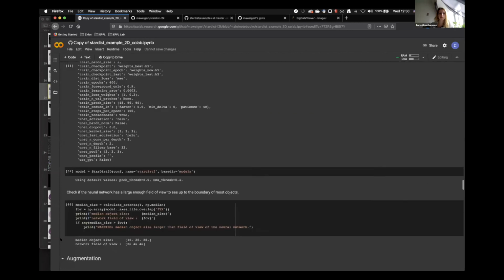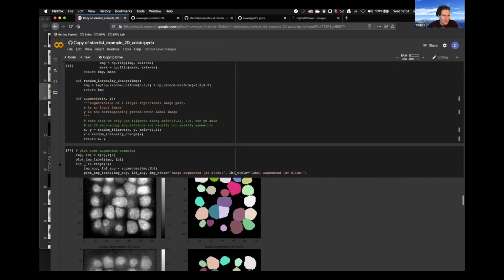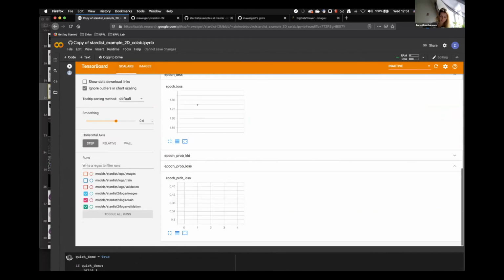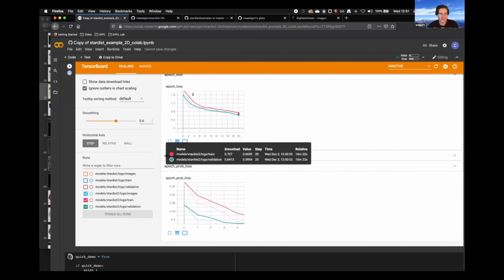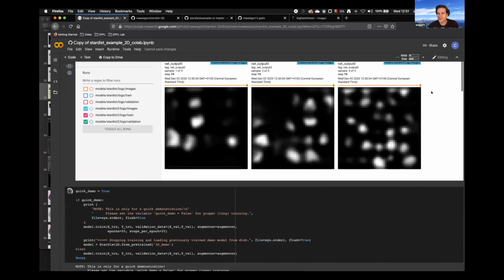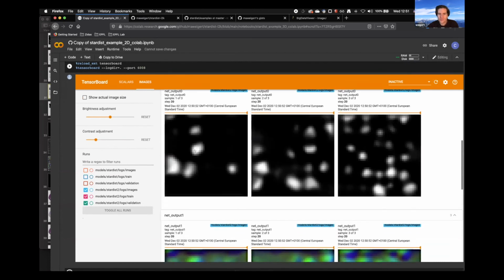Thank you. Sure. Actually, I restarted the training with a few more epochs, and the epoch loss in TensorBoard looks strange. You see it trained a little bit more, and it keeps going down. It will get twice as good at some point, but it's already okay. If you look at the intermediate output, it starts to look a little better. I'm going to reload it. This is the object probability. We predict those two things, object probability and distances.